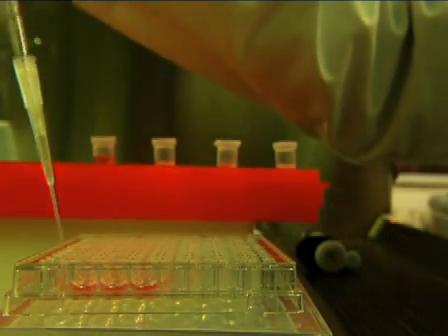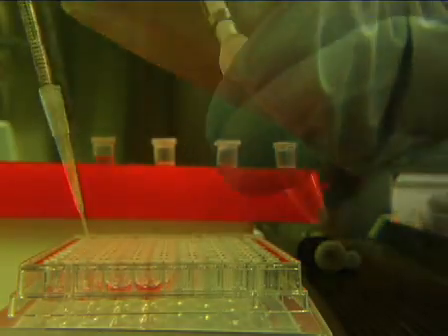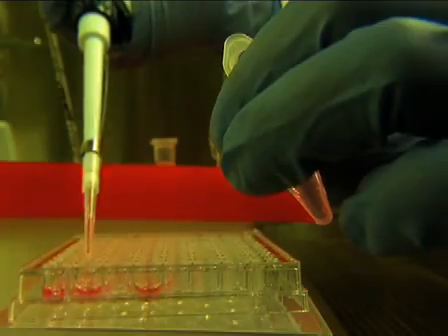Next, remove the media from the 96-well culture plate and replace it in each well with 100 microliters of the bead suspension.